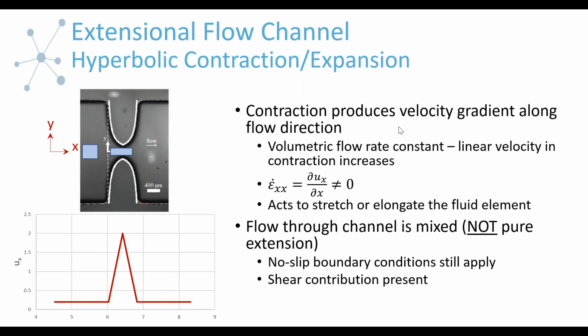And then we've also recently had more interest in extensional flow. We've talked about real-life situations where there is both extension and shear, and they have specific parameters that they'd like us to try to make. So we have talked to people about modifying the parameters to work. That may be an option moving forward. Of course, there are still some limitations because of the placing of the silicone sensors beneath.